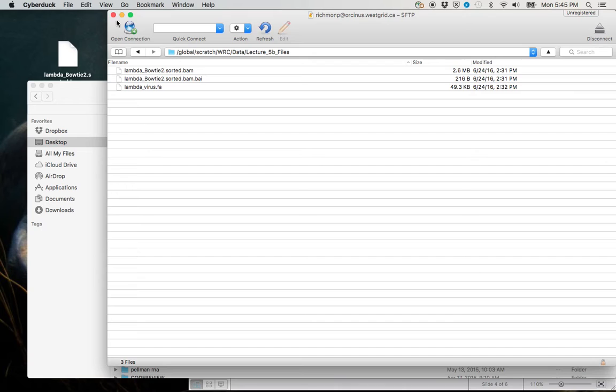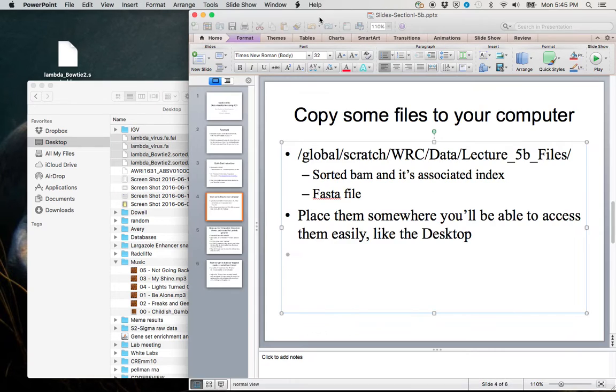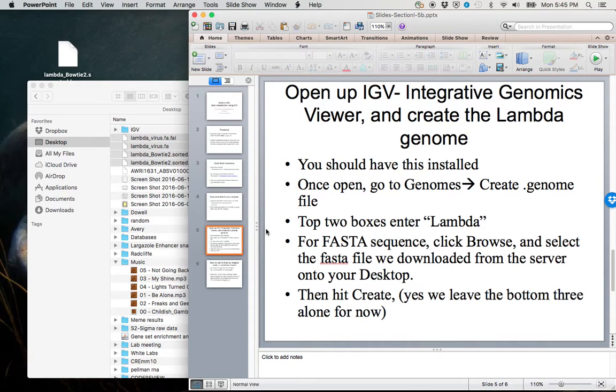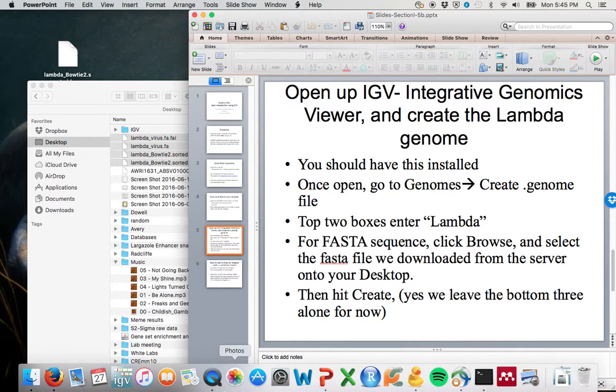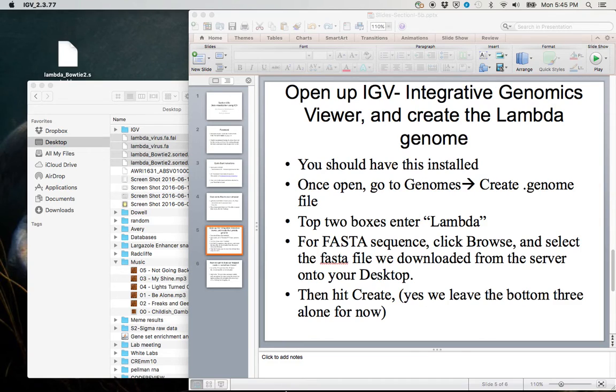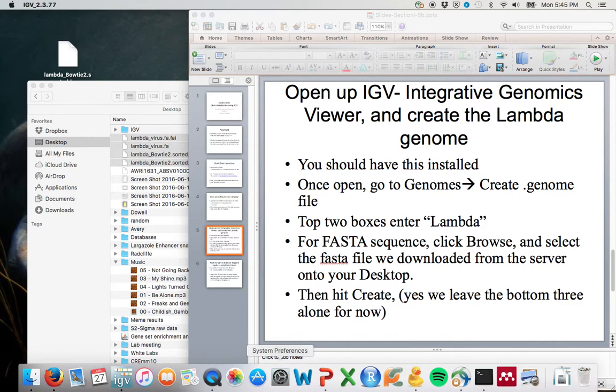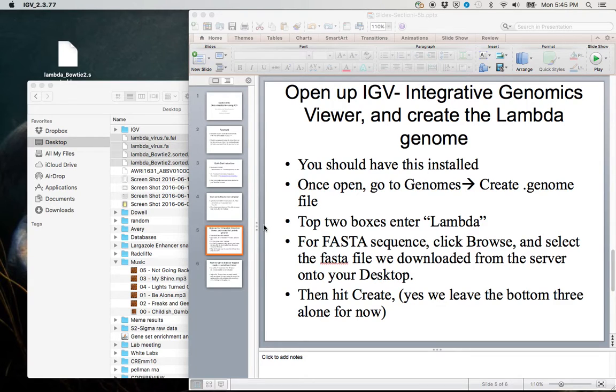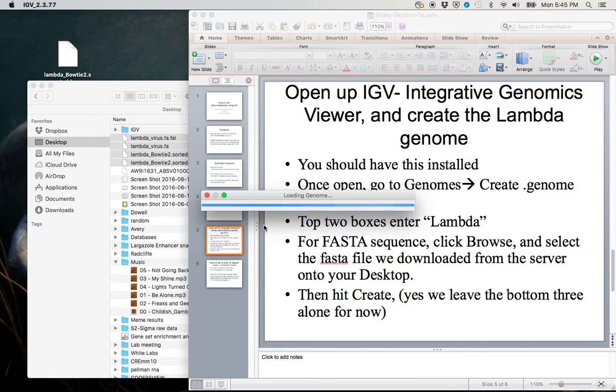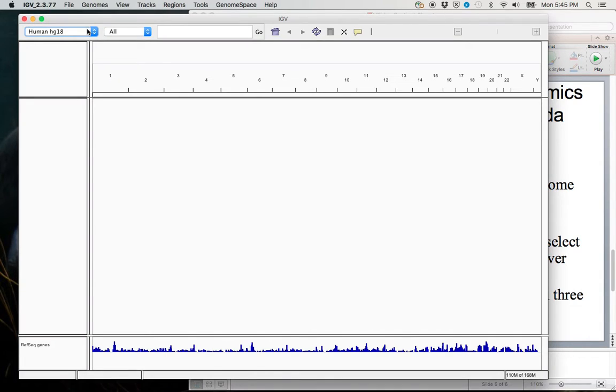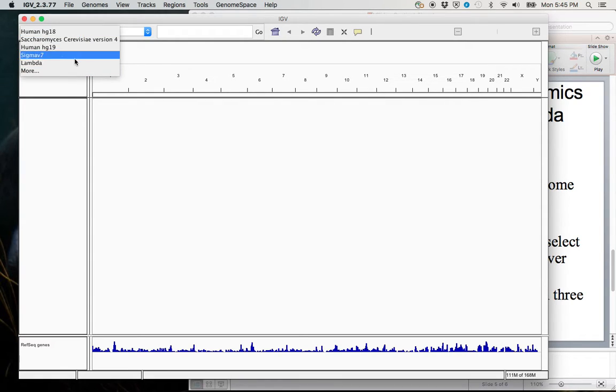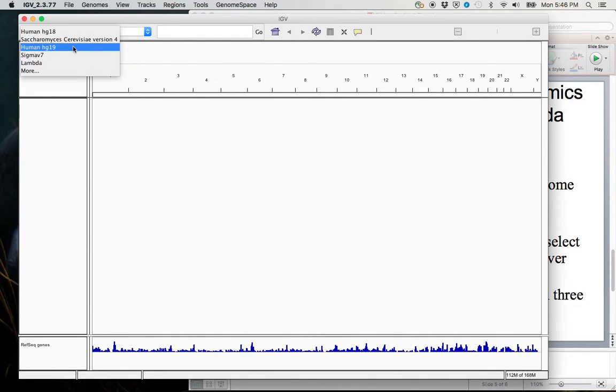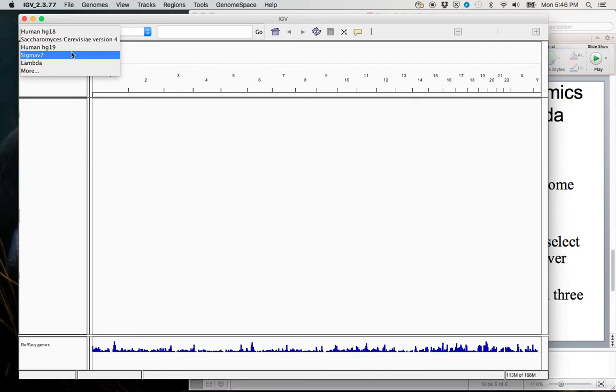So now that we've got our files on our desktop, the next thing we want to do is open up IGV, our Integrative Genomics Viewer. So you should have downloaded this. If not, you can go to the course website to find a link for download. We'll click on our IGV app. You can also find it using Spotlight. So once IGV opens, the default genome usually is one of the human genome references. These genomes come by default. I've actually added this Saccharomyces cerevisiae myself, as well as this Sigma V7, but usually the human genome versions will come just by default with the IGV download.